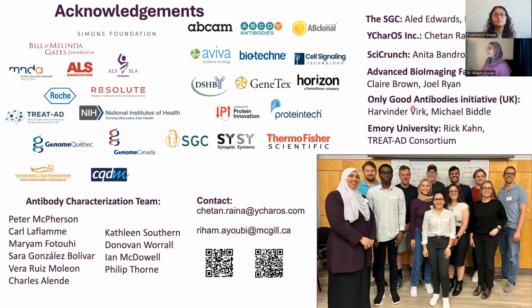I would say the key is using a better, more ideal, more adequate sample where the antibody will pick up only the signal from your protein. Or another option would also be to change your reagent. If you have an option to change the actual primary antibody that you're using, you may have better results with that. I hope that helps.